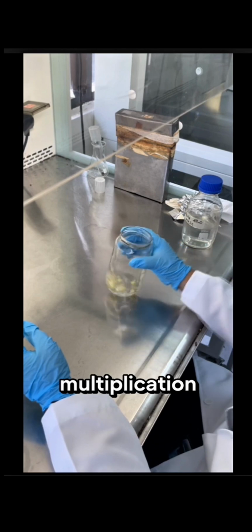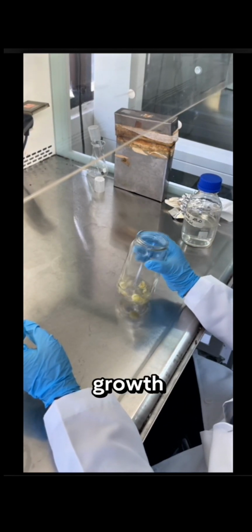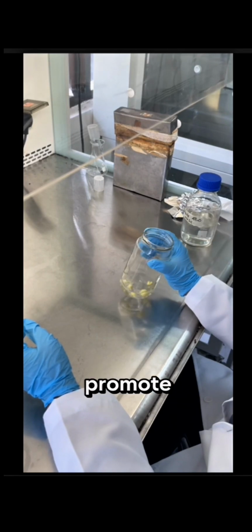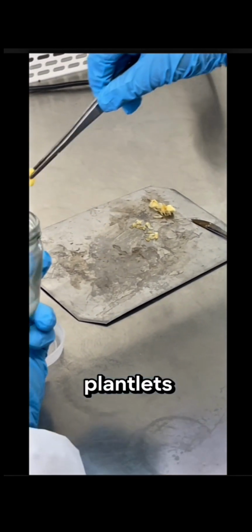Second, multiplication stage. In this stage, the explants are transferred into a medium containing plant growth regulators, PGRs, that promote the multiplication of shoots. This helps to rapidly increase the number of plantlets.